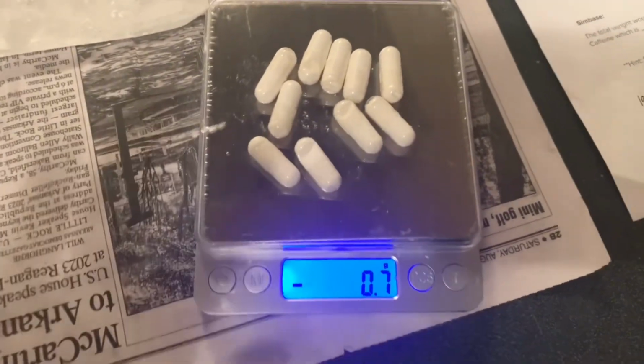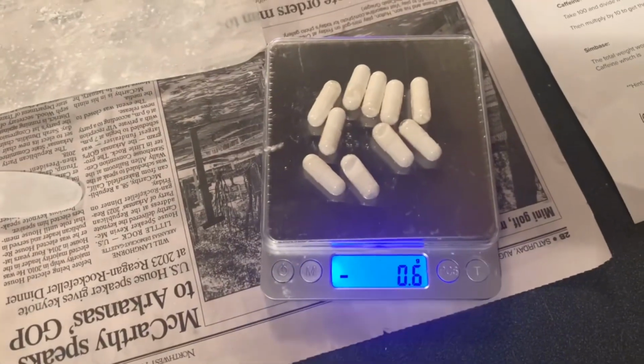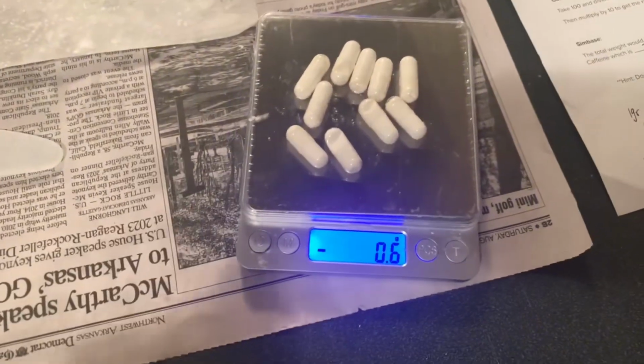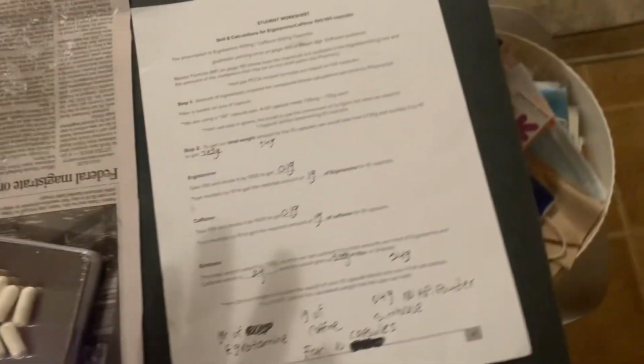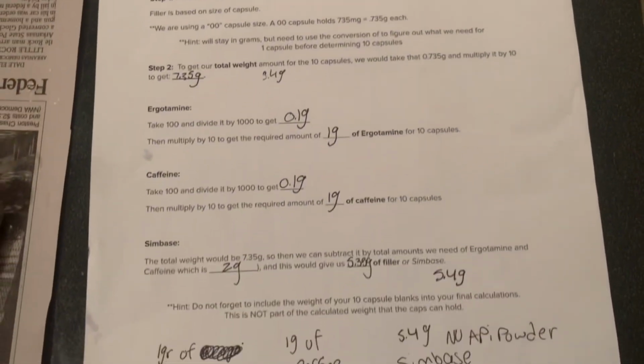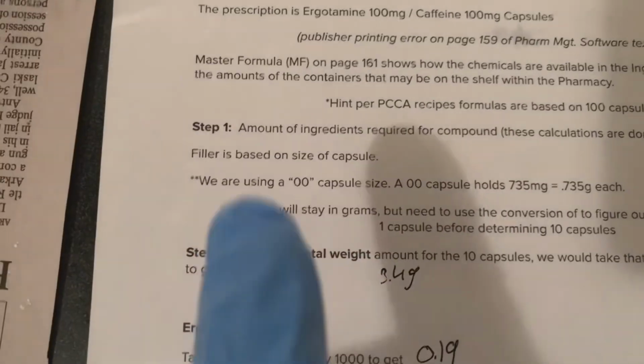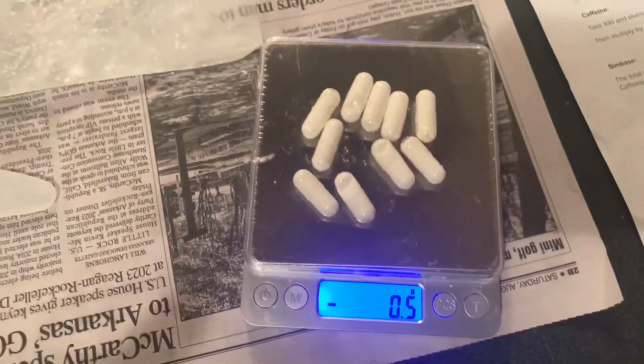So I still have all of this that needs to go inside of there. That's the mistake that I made. So in order for you not to make that mistake, I have all my calculations right here, and this is the total weight that you need. I understand where I messed up.